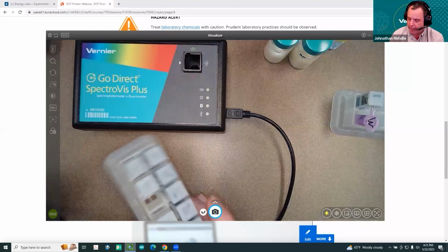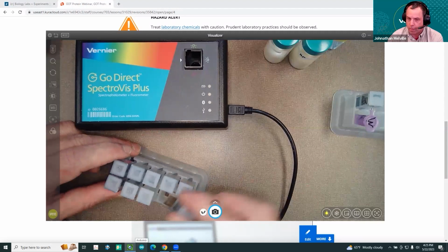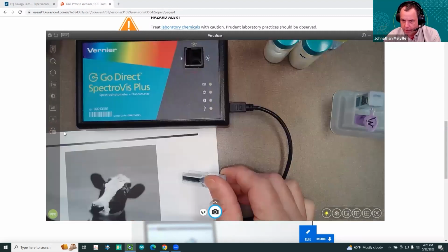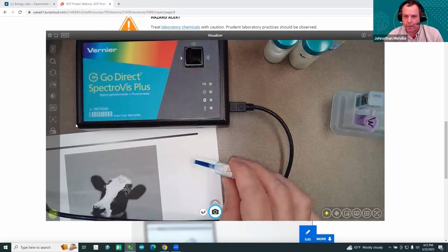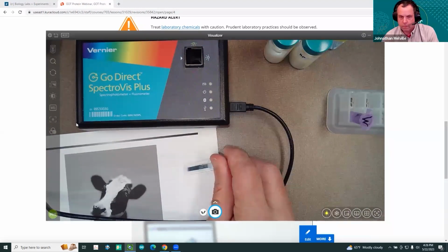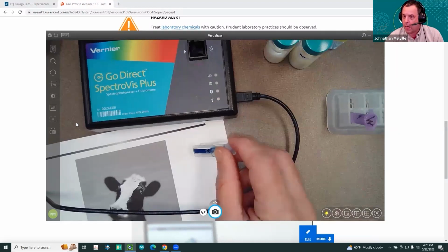So these are my standards. You can see here's some PBS. This is just normal Bradford. Here's, let me show this on a white background. There's some Bradford that's not been reacted very well. It's not got a high protein concentration. Here's the 2 standard. You can see it's bright blue. It's much bluer. And then here is just milk. You can see that that's slightly blue. And here's high protein. It's a lot bluer.